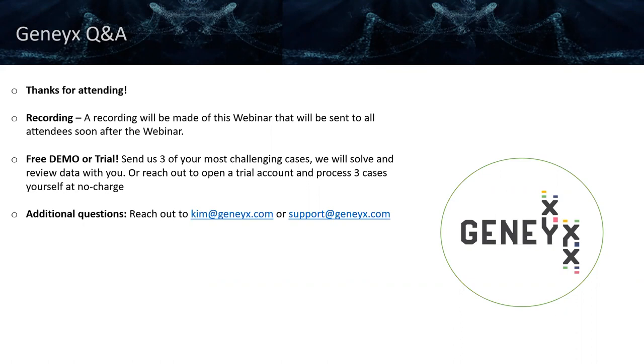And so with that, I think we'll transition into the Q&A. I know we only have a couple minutes, but I think Kim has probably flagged a couple questions. Hi, Eli. Yes, thank you, Eli. Great job. There have been a few questions that have come in. The first one for you is, do you have workflows for cancer?